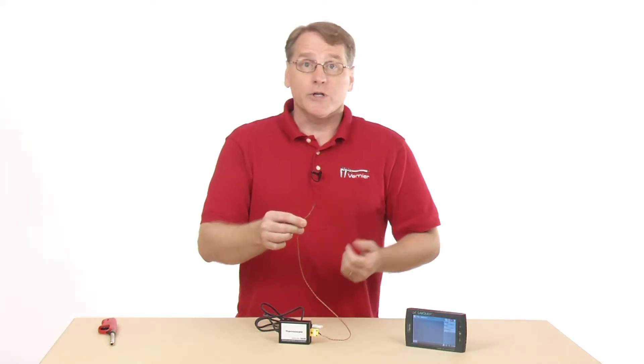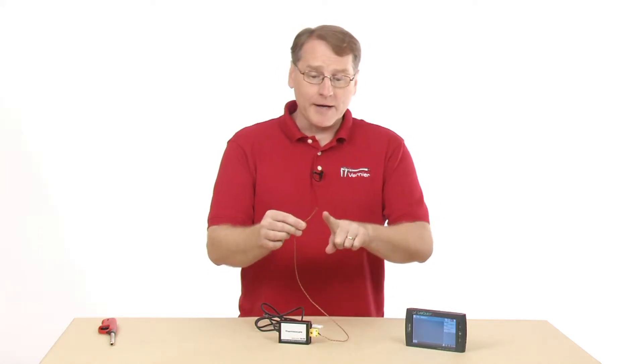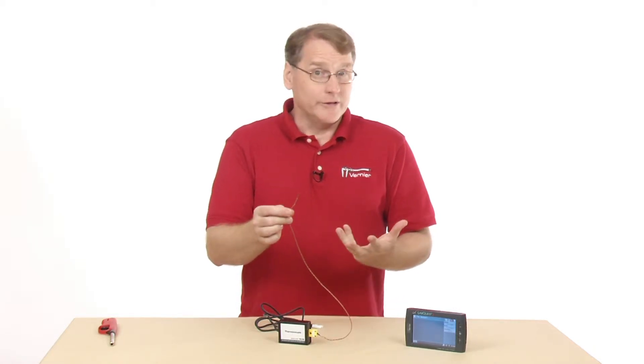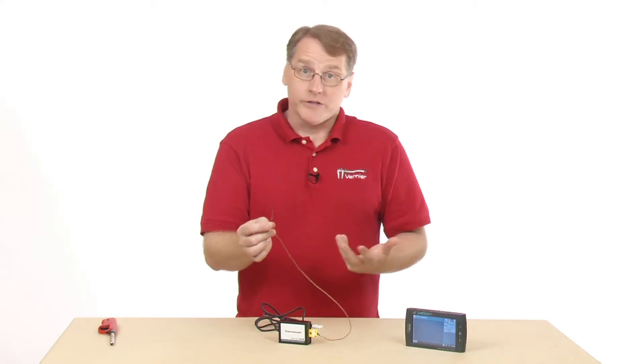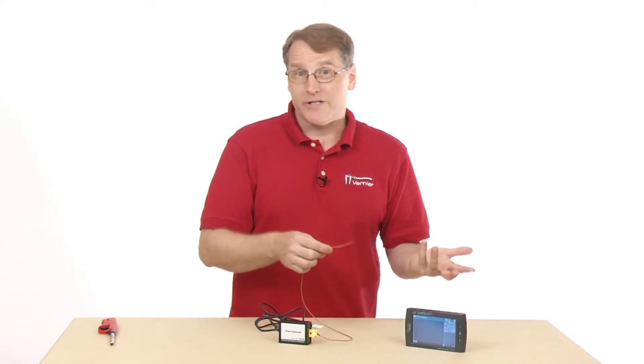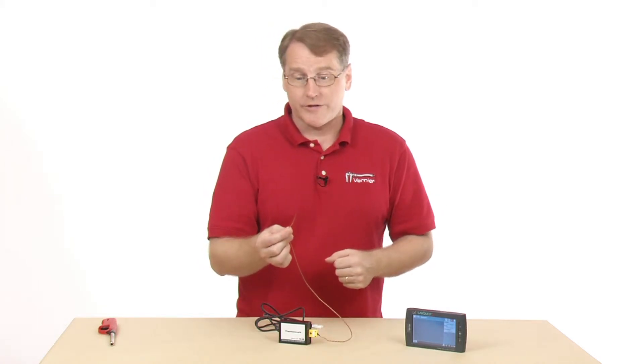We'll just do a quick data collection. I'm actually going to put this into a flame and we'll take a look at the flame temperature. You can also go down as low as liquid nitrogen, so it's minus 200 degrees C to 1400 degrees C as the operational range.